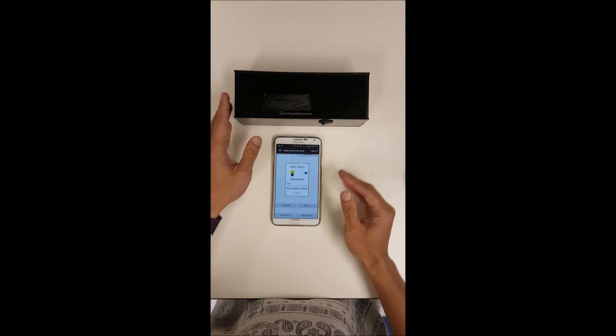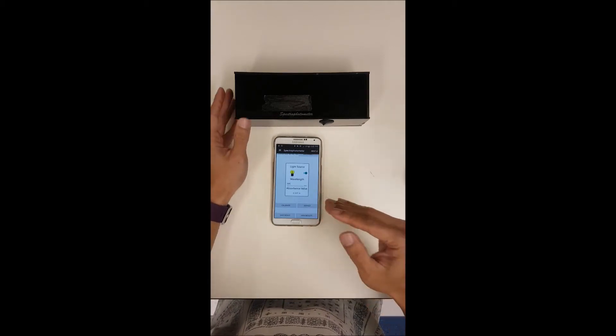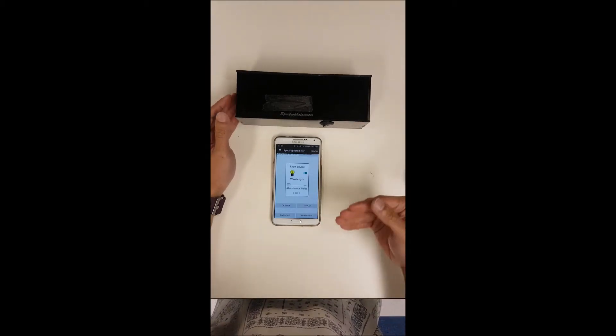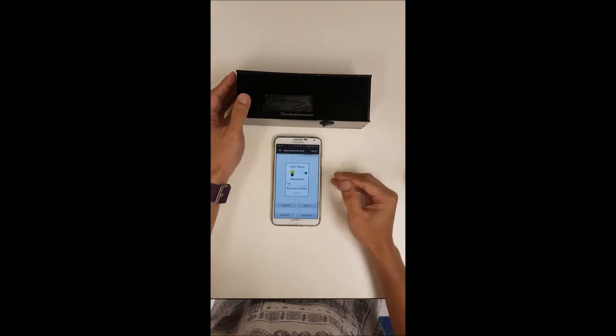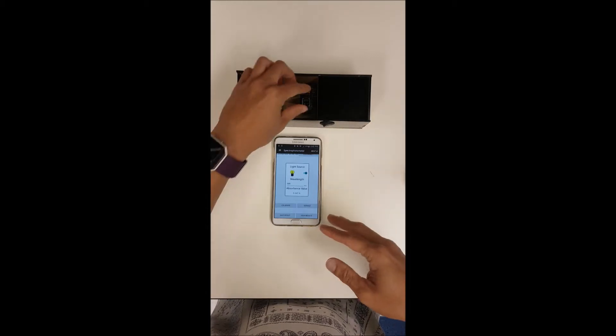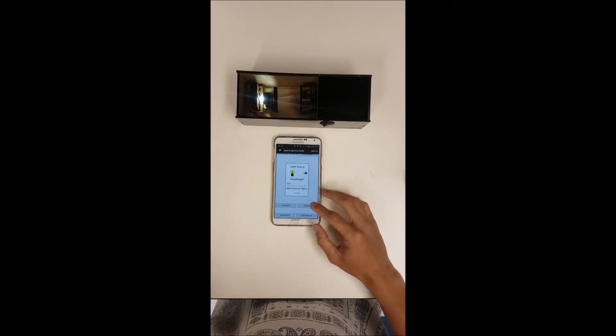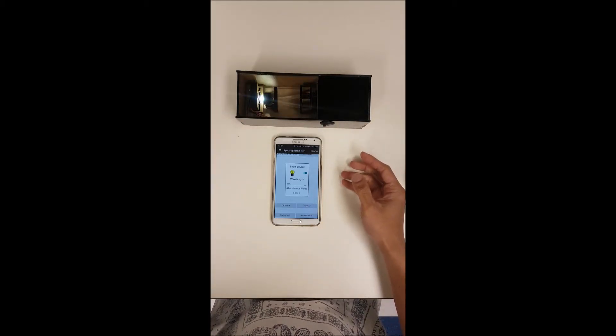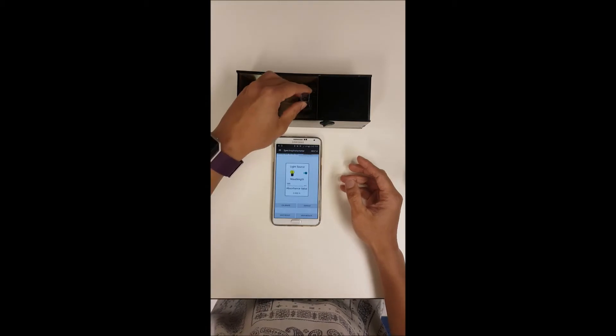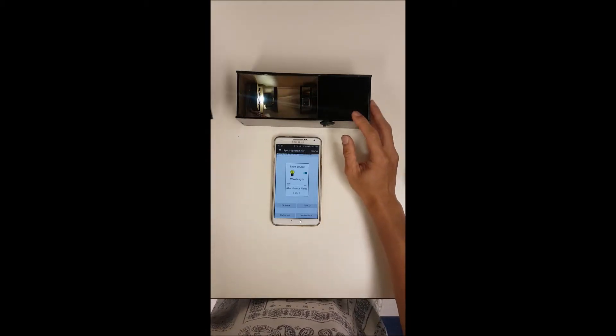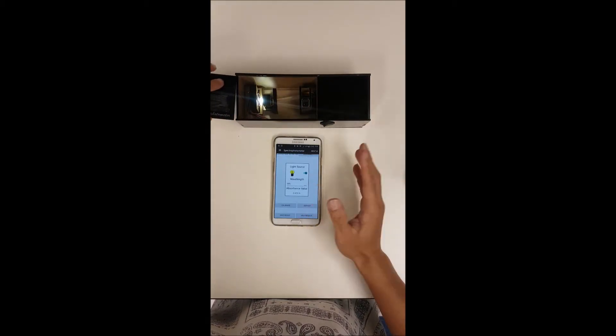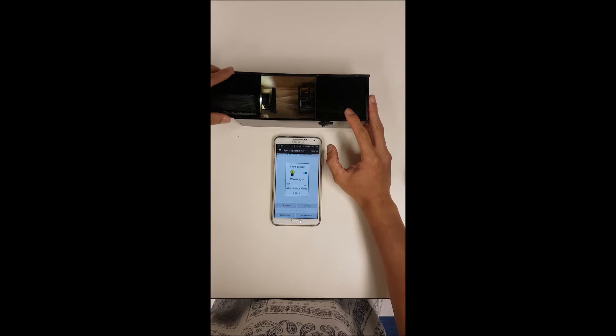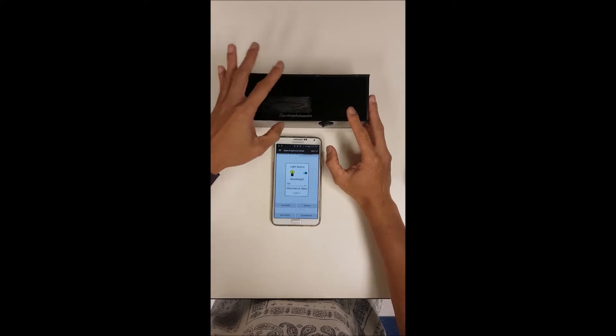From here you don't need your blank anymore and you can put in your samples as and when you need to and the readings would come to you with the blank already subtracted. If you want to restore it back to the original default, just click on default and you will see that we go back to close to 0.5 absorbance.